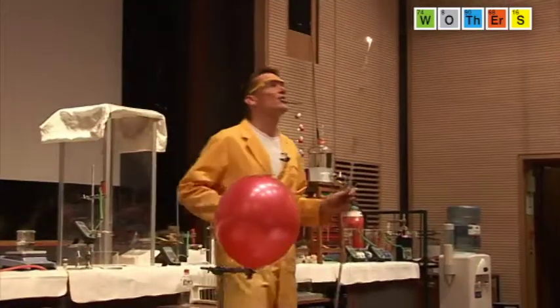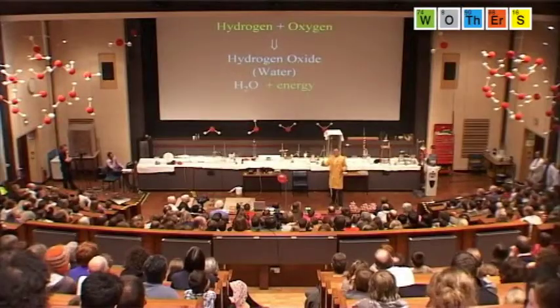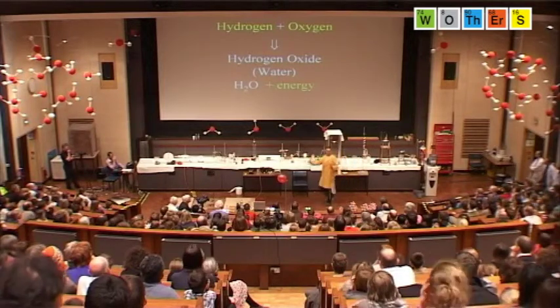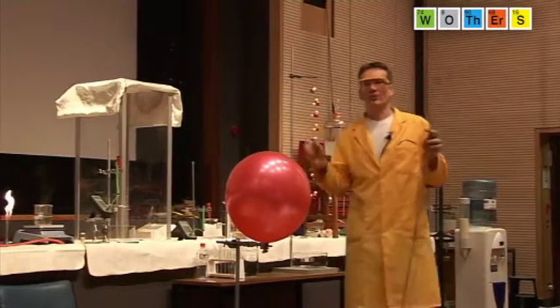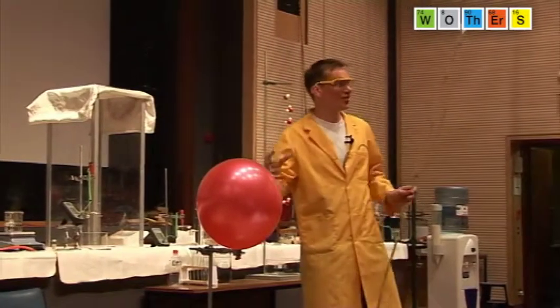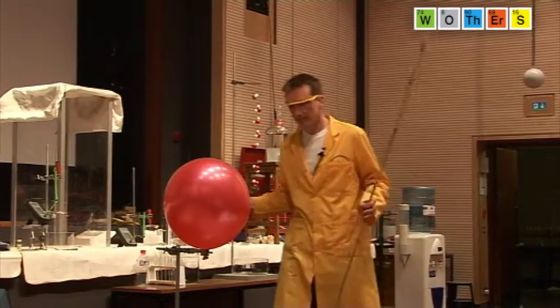So we've seen then the reaction of hydrogen. This is hydrogen now recombining with the oxygen in the air, and this forms hydrogen oxide or water. But we don't see the water because actually it's instantly vaporized and spread out the room as water vapor. So we don't see that, but it's reforming the water, and it's also liberating a lot of energy. And no doubt you felt the energy there as the hydrogen and oxygen recombined.